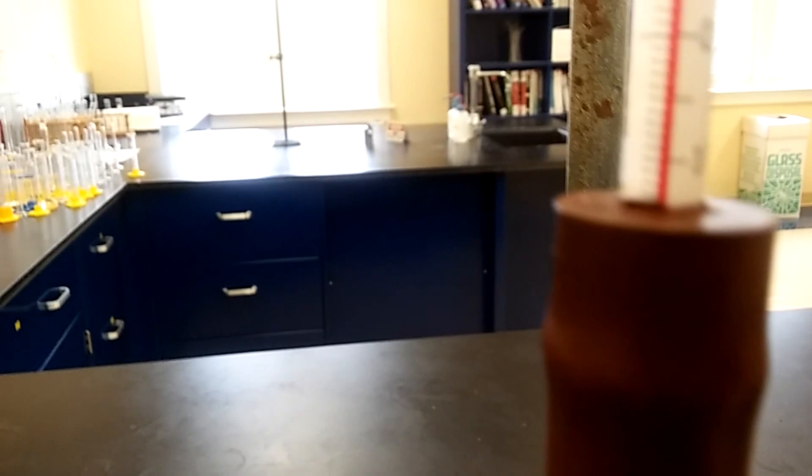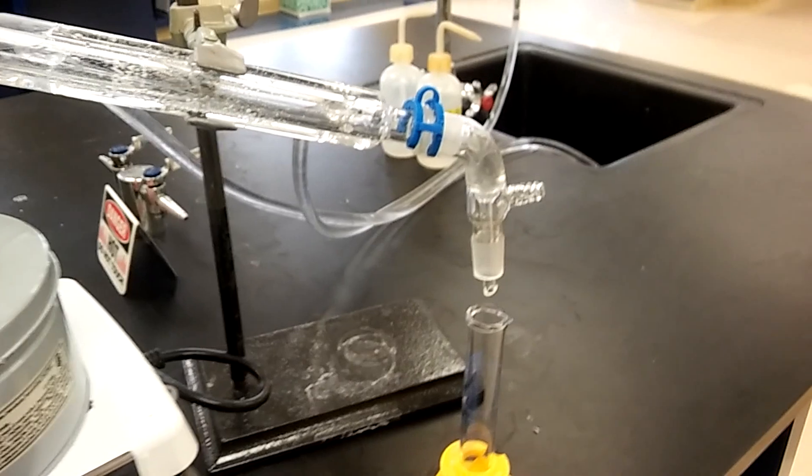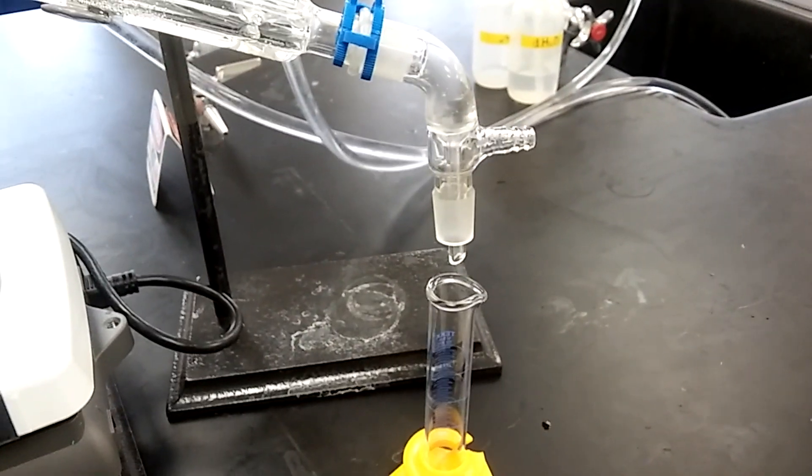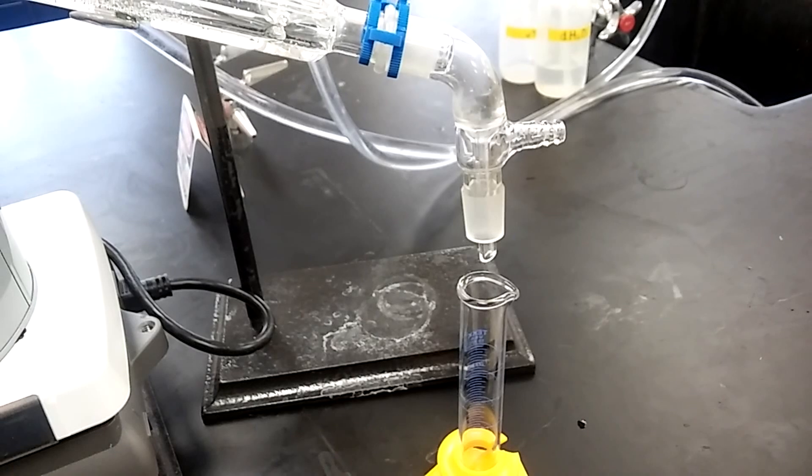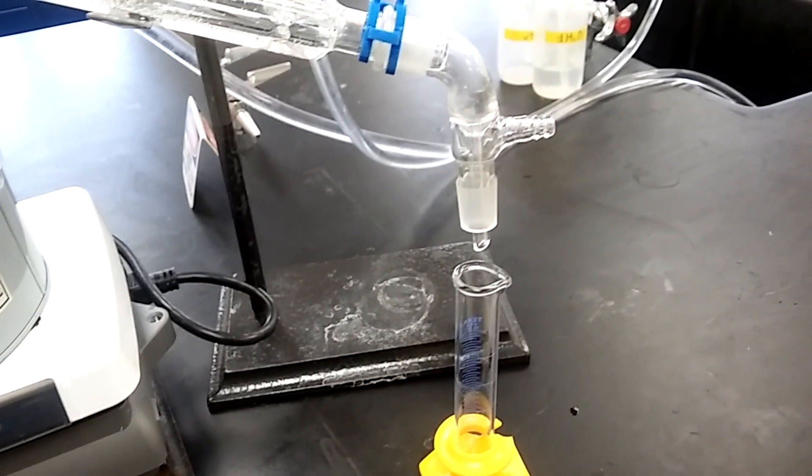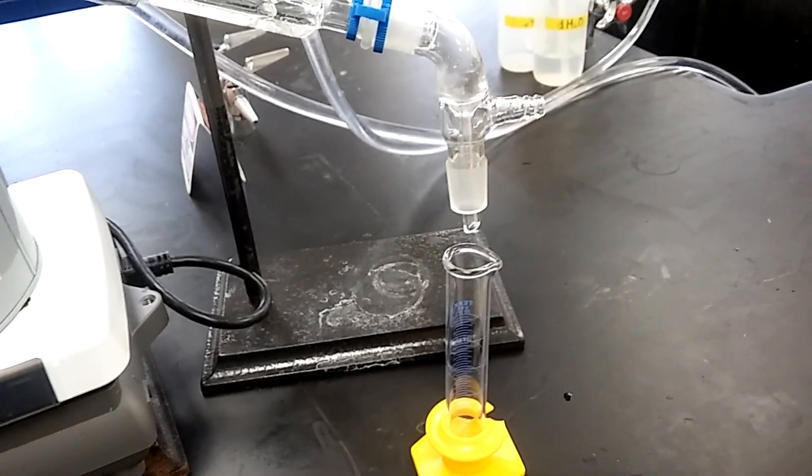We're gonna collect whatever comes through before 49 into this flask, and I will immediately switch it to a different flask at 49. I will collect anything that comes between 49 and 52 and then I'm done with the lab.